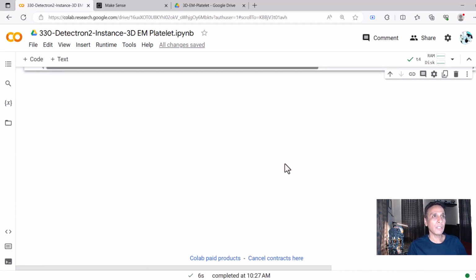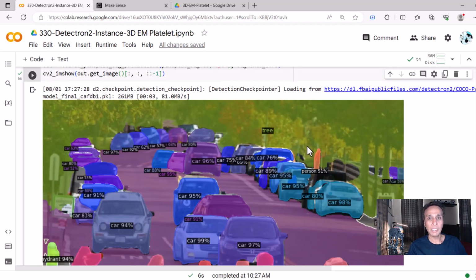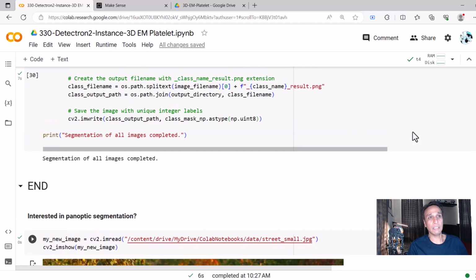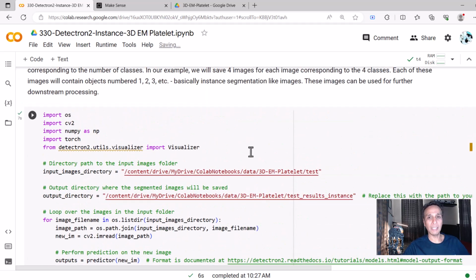I am just showing this for the sake of completeness, but what we have done up here with our cells is pretty much the extent that I have used the Detectron2 model. Again, apologies for this long video, but I wanted to capture everything relevant to using your own training data to train your models, and not just training the models, but also saving data, exporting, doing the measurements and all of that in one video. Otherwise, I don't want you to wait 2 more weeks for part 2 of this.